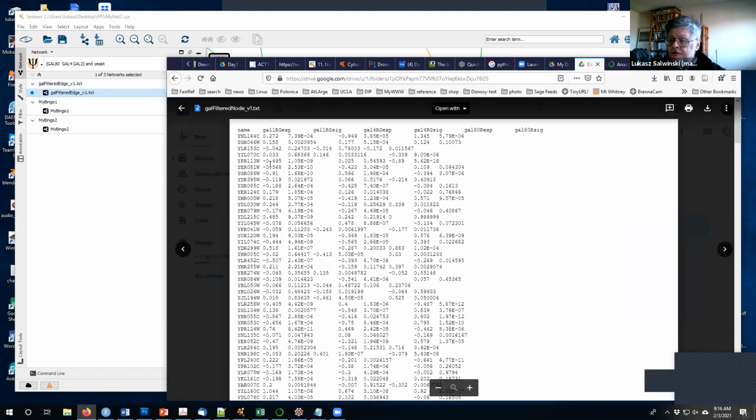This is going to come from your experiment, or someone interested in data analysis will provide you a file that looks like this, more or less, with the rows corresponding to particular proteins or genes. There will be some sort of identifier for the protein or for the gene, and then a bunch of numbers reporting the results of experiments. Let's say change in expression in case of expression data, methylation level in case of NGS sequencing, or whatever might come out of experiments.